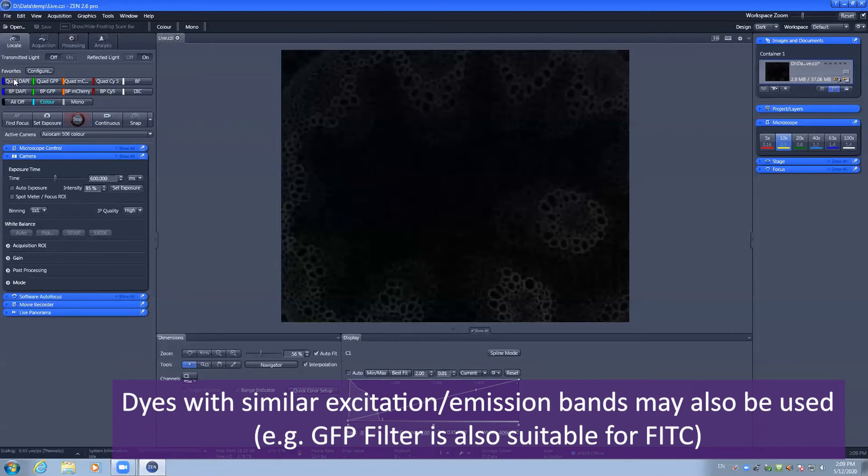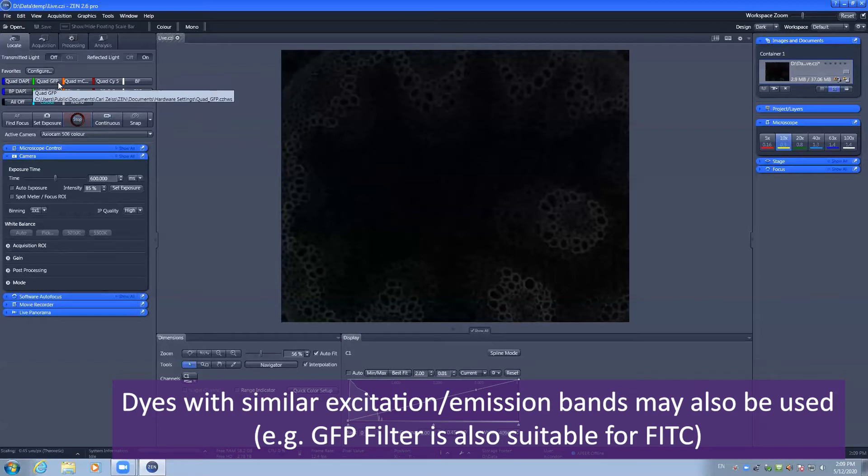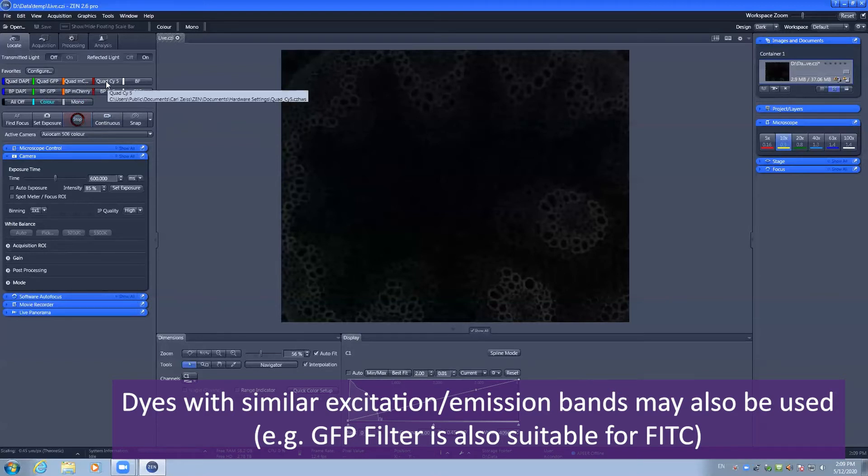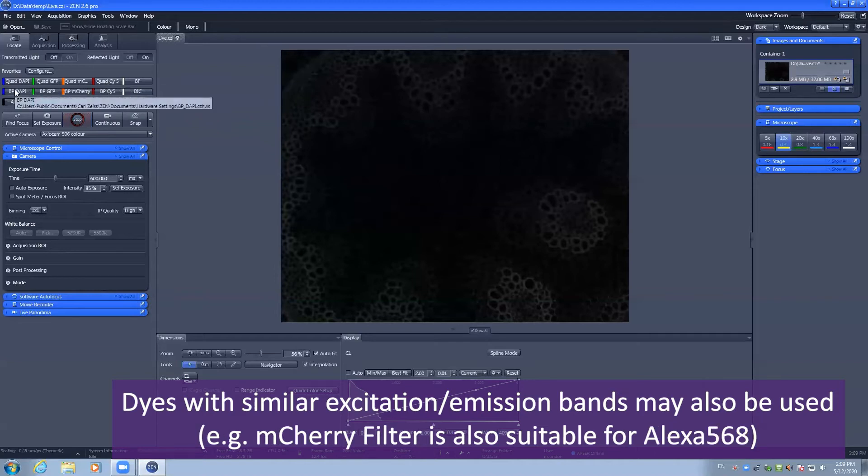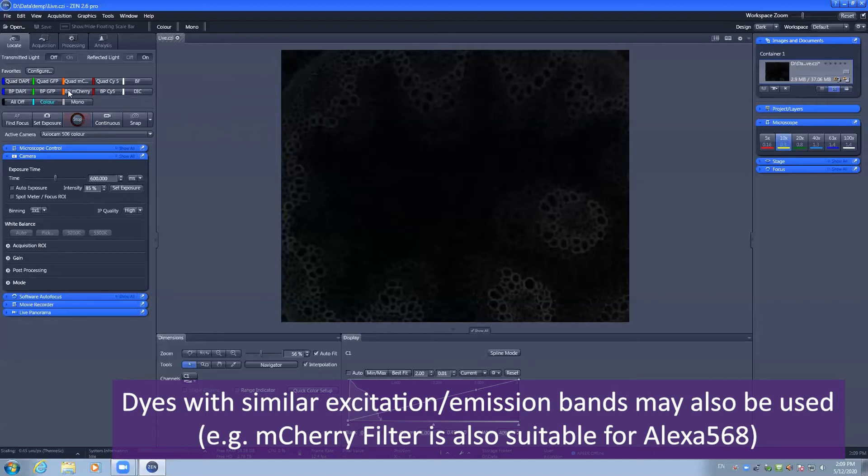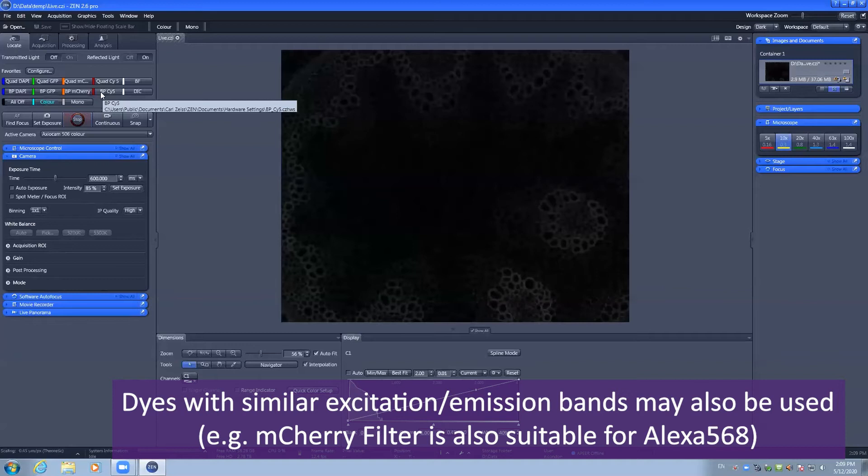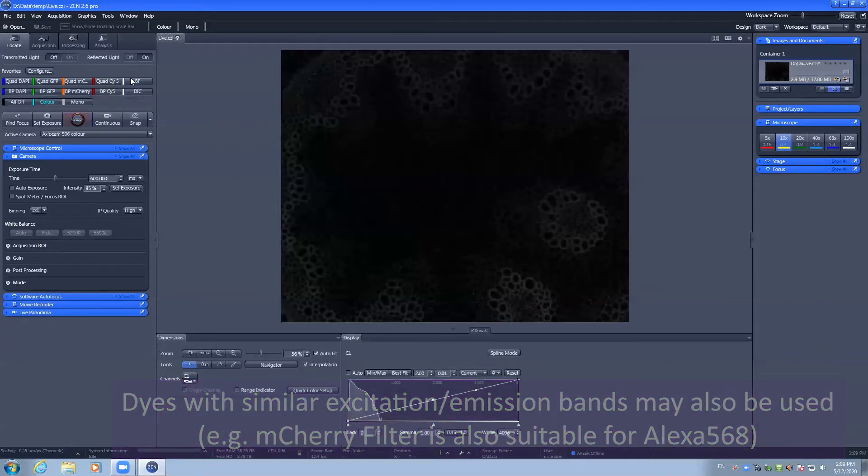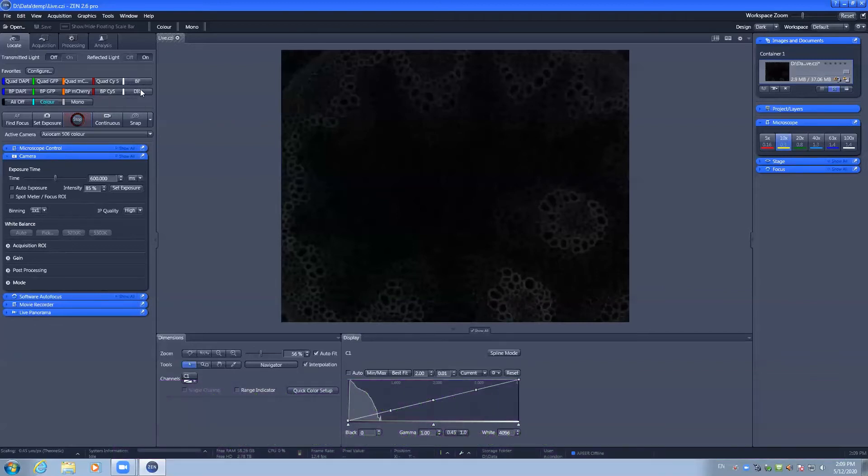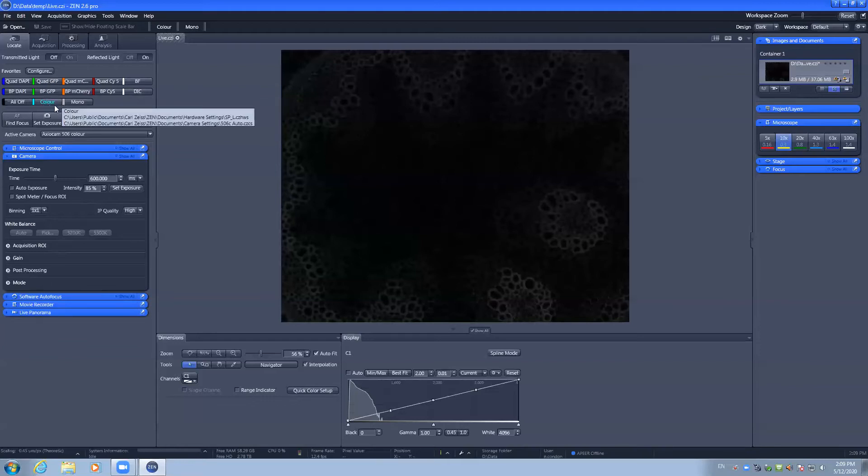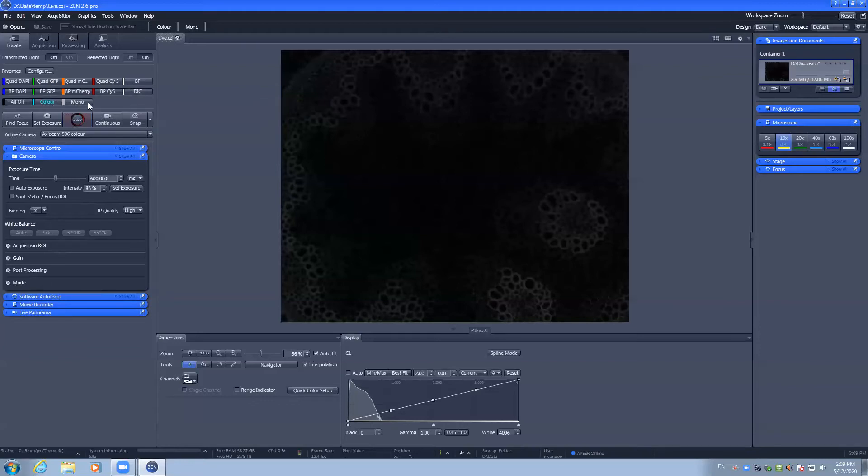This microscope has a quad band filter which covers DAPI, GFP, mCherry, and Cy5. We also have individual band pass filters for DAPI, GFP, mCherry, and Cy5. There are single channels for bright field and DIC, and you can choose to use the color camera or the monochrome camera.